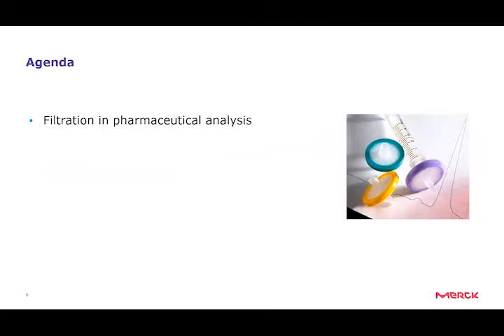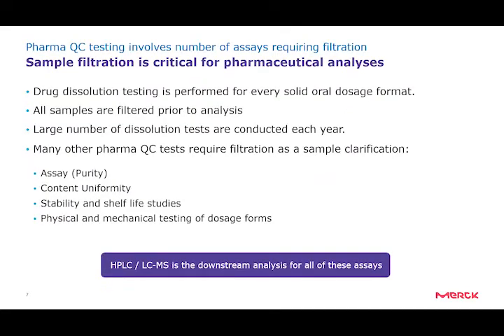Now, going to filtration in pharmaceutical analysis, I'm going to focus mostly on pharmaceutical analysis here. Especially in pharmaceutical QC testing, there are a lot of assays which require filtration. For example, drug dissolution testing is performed on every oral solid dosage form, and all the samples are filtered prior to analysis. There are also a large number of dissolution tests conducted each year.